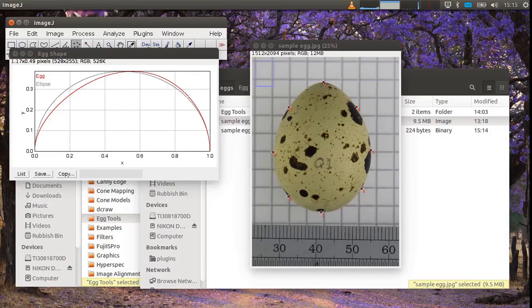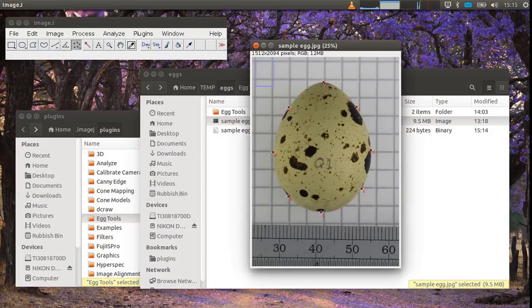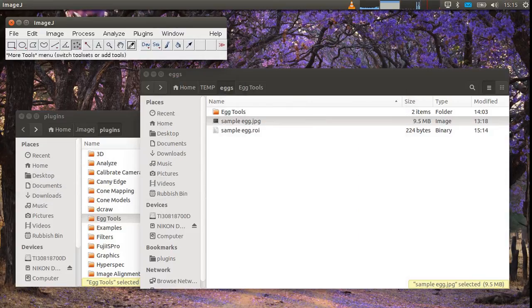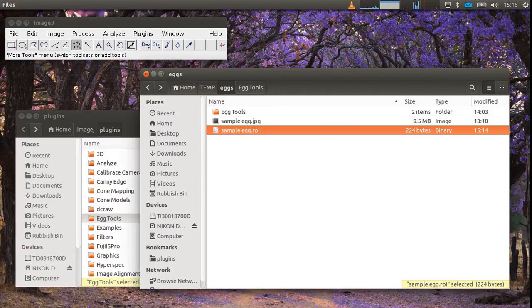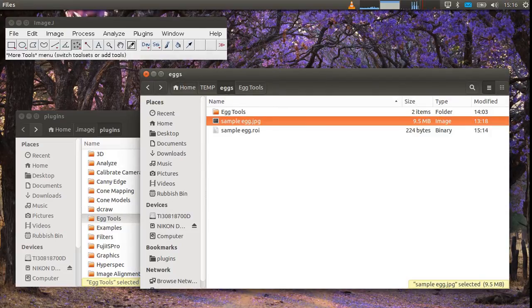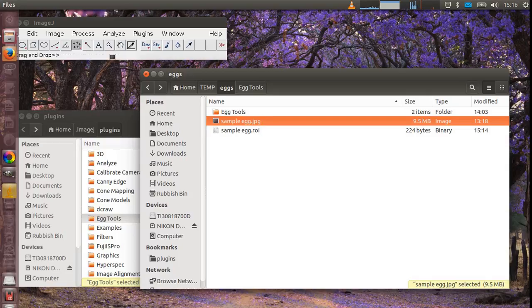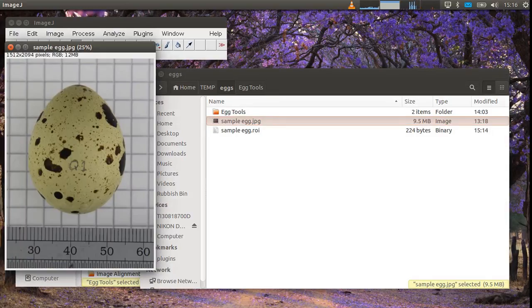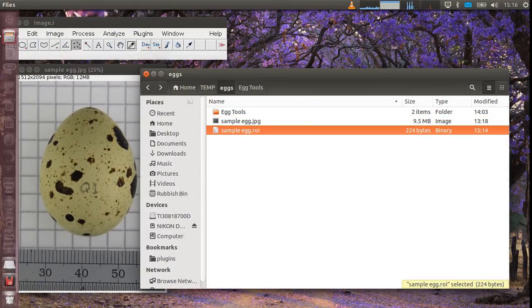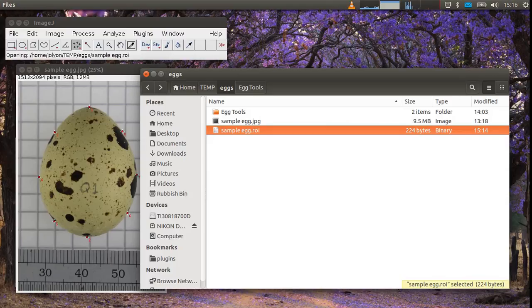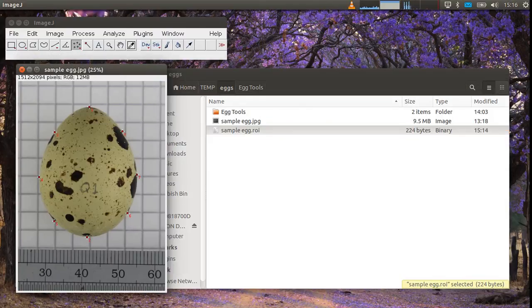And you can see in the original folder where we opened the egg image there's sample egg roi and this is the selection coordinates for the egg. So if we open up the egg again just drag it into ImageJ and then we drag in the selection coordinates into ImageJ. You can see it places the points around the egg so they're saved.